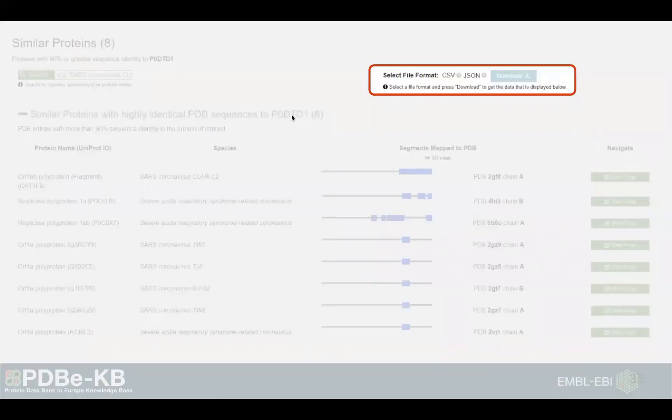One thing I would like to highlight is that you can not only download the coordinates like you've seen previously, but you can also get all the other data that we are showing. All the annotations, all the ranges, all the text, everything. In both CSV and JSON format for all the different sections. You can grab the data and perform any kind of analysis.